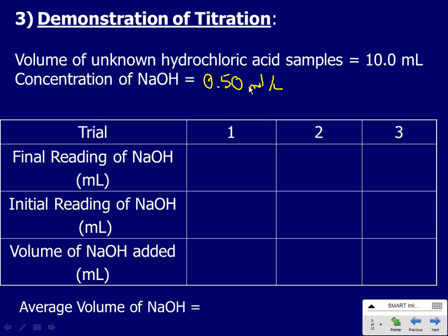All right? The second thing you have to do, and this is going to be more for the second experiment, not the first one, and that is to prepare the pipette. In tomorrow's experiment, we're actually going to be titrating with a solid. So we'll be measuring out a little bit of solid in here. The acid is actually a solid acid. We're going to dissolve it and react it. But in the next day's experiment, we're going to be reacting it with vinegar. So I need to prepare the pipette in the same fashion in which I've prepared the burette.